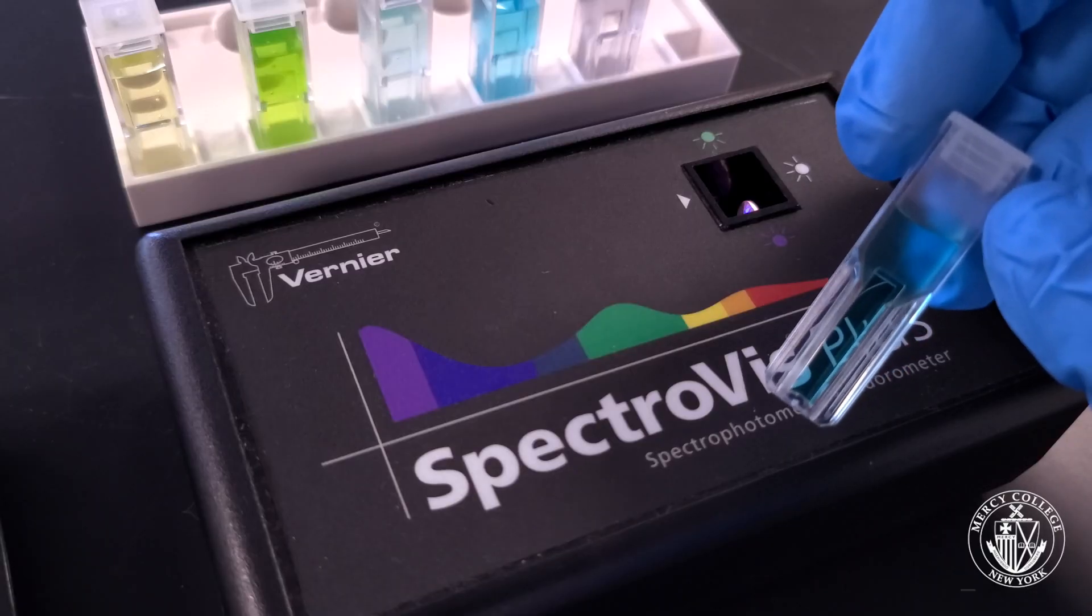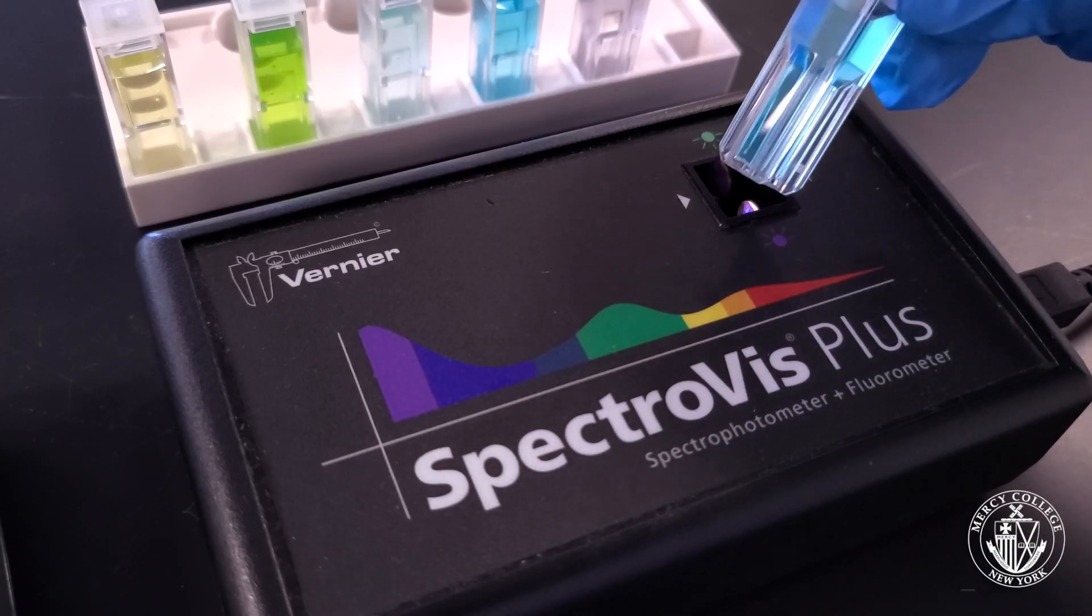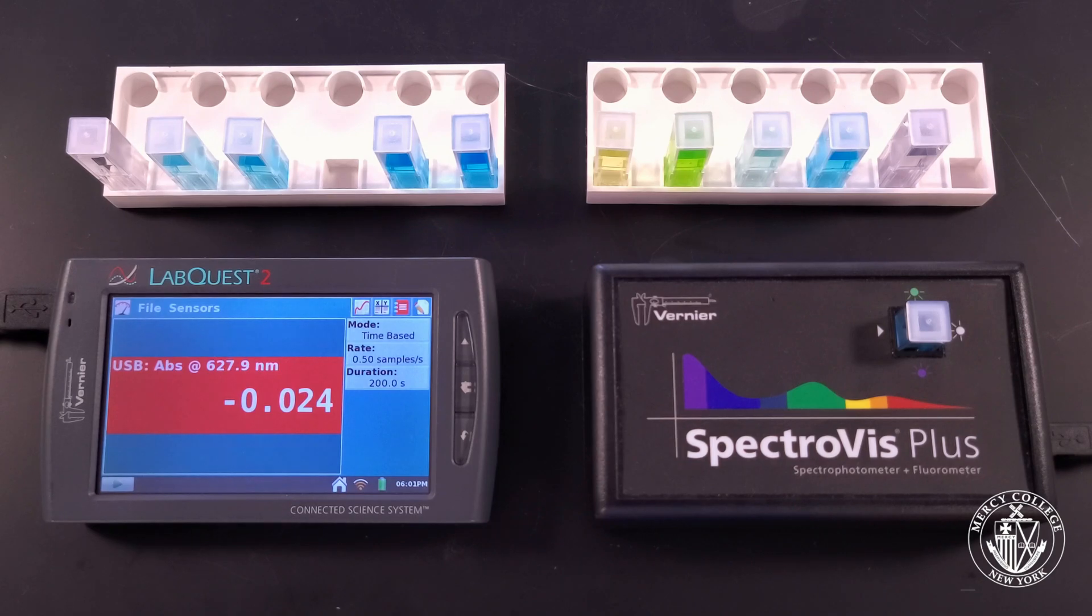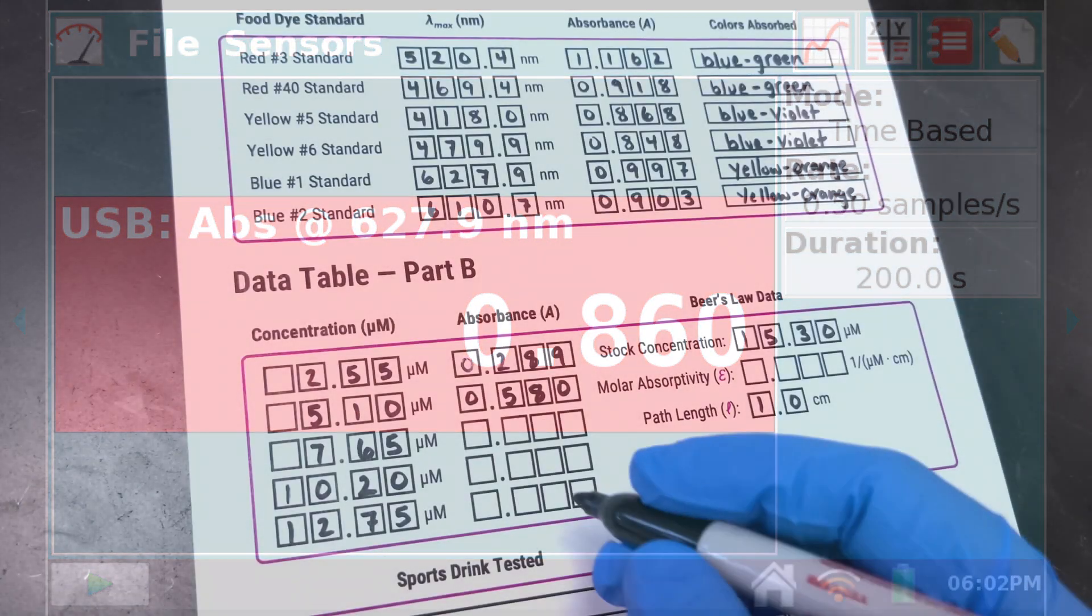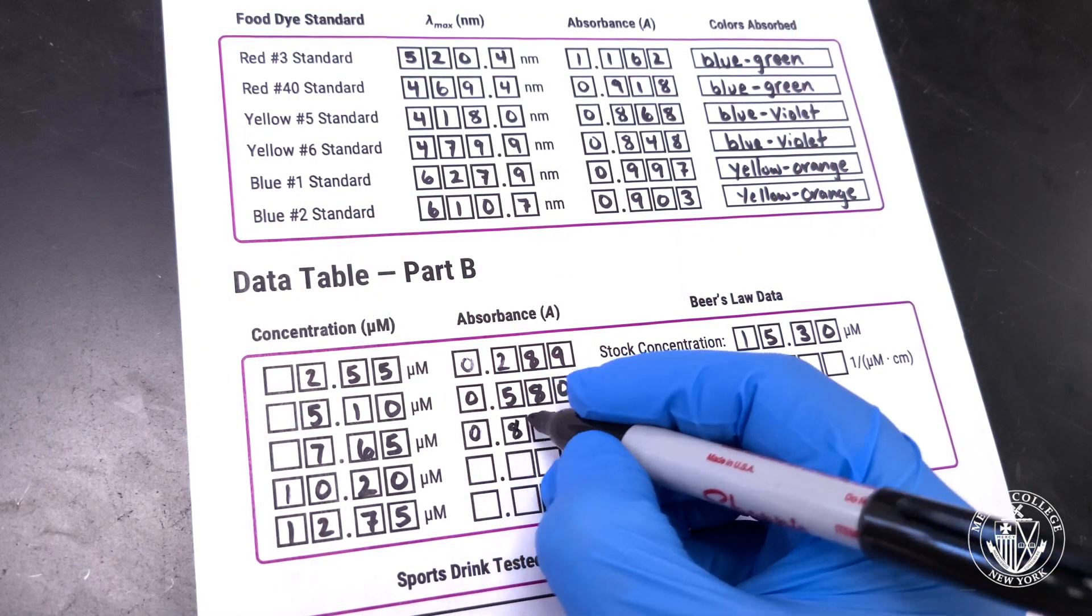Repeat the same process for your third dye standard, making sure that you let the absorbance stabilize before recording it on your datasheet. This dye standard looks like it has an absorbance of 0.860.